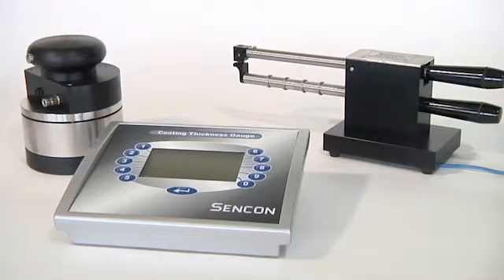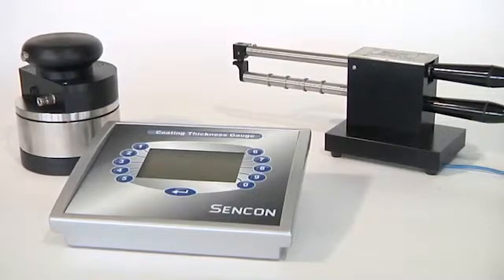Sencon's coating thickness gauge offers fast, reliable and repeatable coatings measurement.